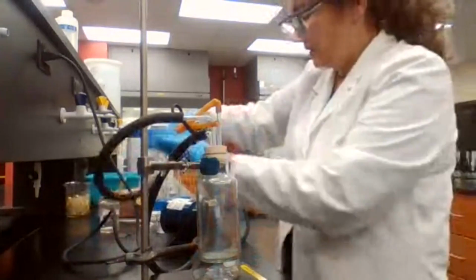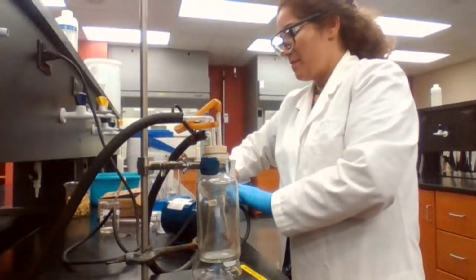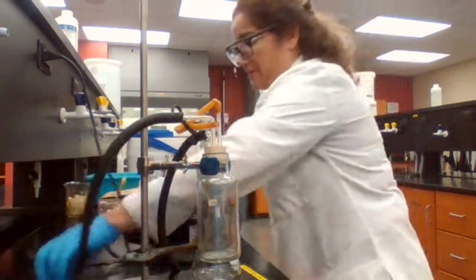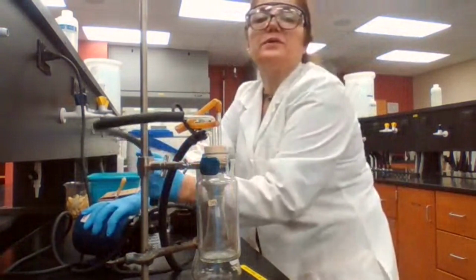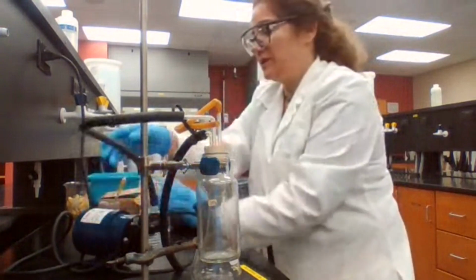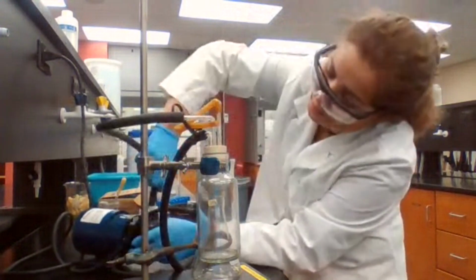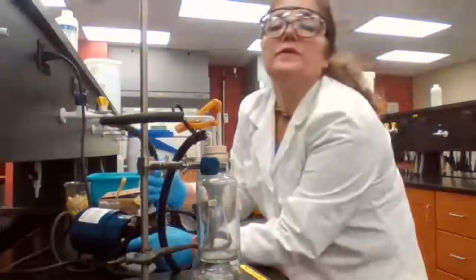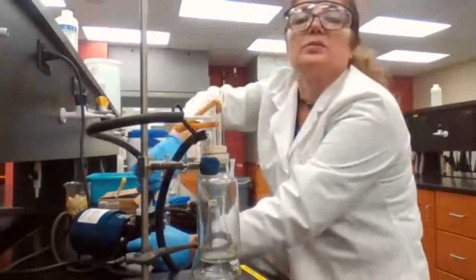Purpose of washing with water. Washing with water would remove... What is it trying to remove? What will be removed when you are washing with water? Remove contamination that is water soluble.